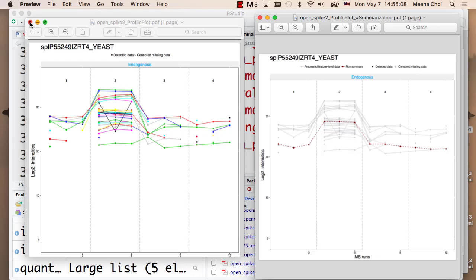Next section, I will move on to group comparison and subject quantification. However, if you want to practice the same thing for Progenesis and also for MaxQuant, if there's a folder, just copy the same few lines, but double check the missing values and then replace the censored intensity 0 or NA, and it will be generated automatically. Please practice, or you can draw something else, some background protein, how it looks, and please let me know. I will go around and answer your questions.